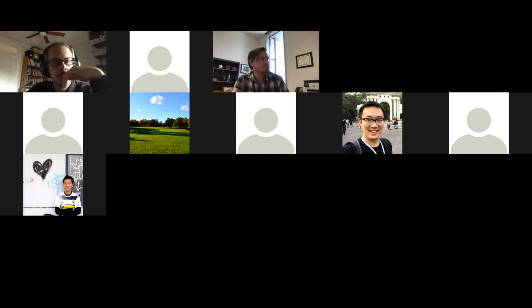These crystals actually were super, super robust. So they could handle room temperature on a standard holder, and we collected great data. That was another reason why it was so quick to do. In those cases, you don't necessarily even need a cryo holder. But I didn't want to bring that up because then people will be, wait a second, you said you're using cryo. But yeah, that's a good point.